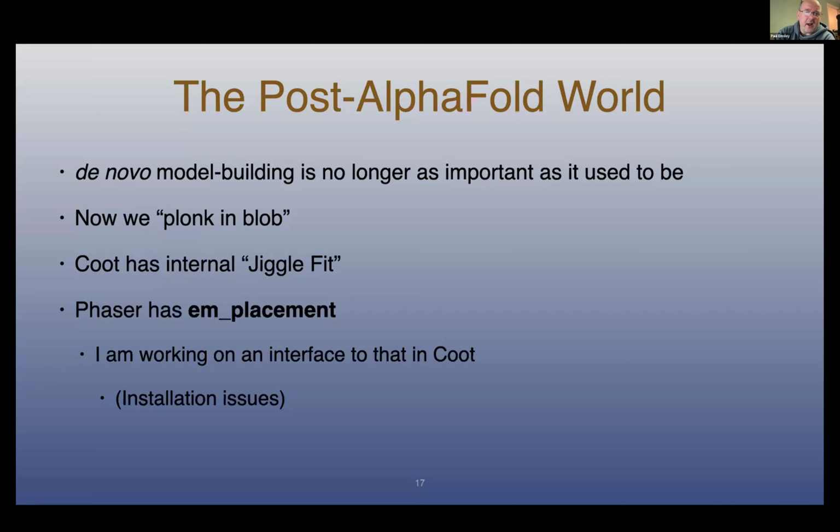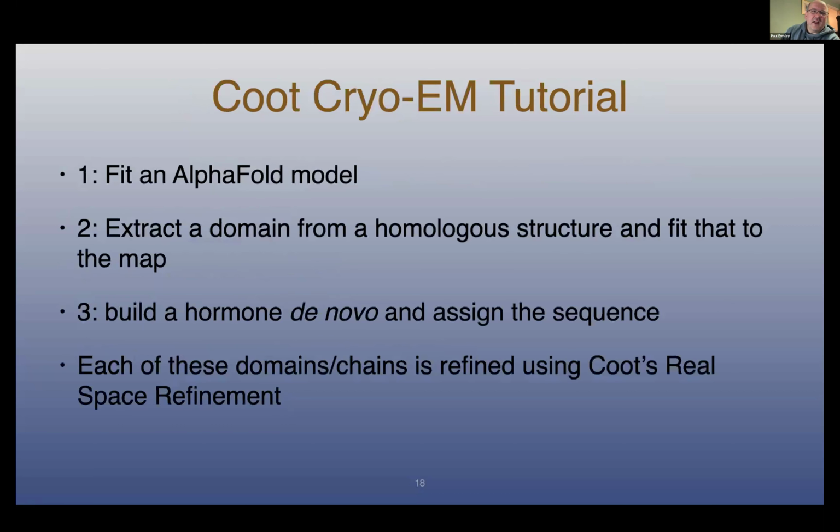There's an interface to ChimeraX. I'm working on an interface in Coot. I have some problems with installing it though. I'm waiting for other people to do an update. Right. So if you look at the Coot CryoEM tutorial, part of it is to fit an AlphaFold model.